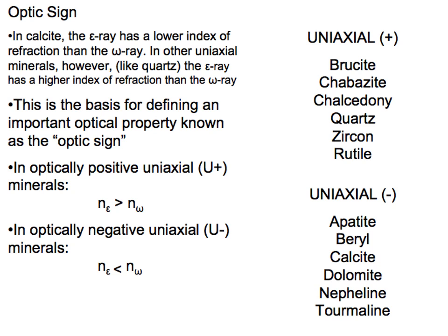So now you should be thinking, how can we tell those apart? I said that it's useful, so we should be able to tell it apart. Birefringence is just the difference between the two wave speeds. It's an absolute value. Interference color doesn't tell you which ray is fast, it just tells you the difference between the two. At least not by itself. But the designers of our microscopes were very, very clever.